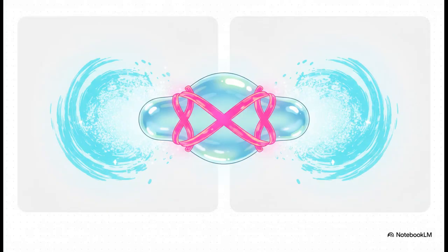It's basically a microscopic tug-of-war. On one side, you have intense centrifugal force from that rapid spin pulling the drop outward, trying to stretch it out. On the flip side, the liquid's internal interfacial tension is fighting right back, trying desperately to keep that drop perfectly round. By measuring the drop's curvature during this high-speed spin, using mathematical models like the Young-Laplace or Vonnegut equations, scientists can calculate the exact tension holding the whole thing together.